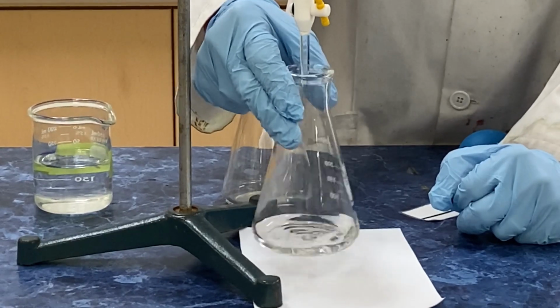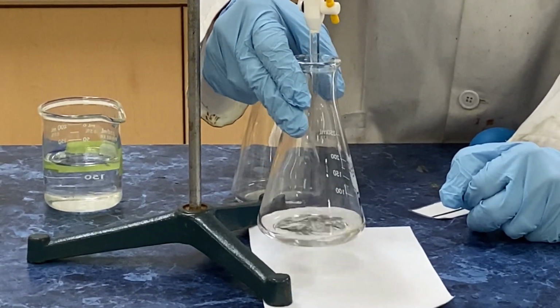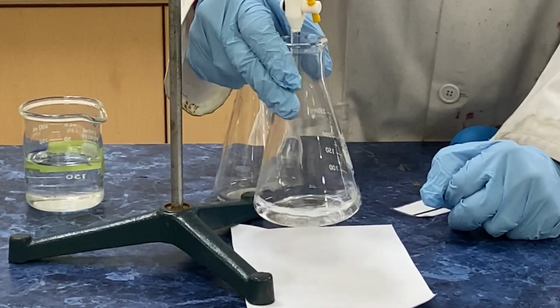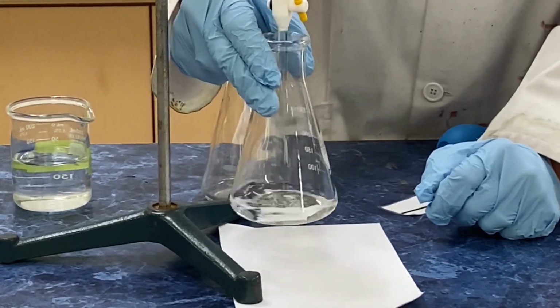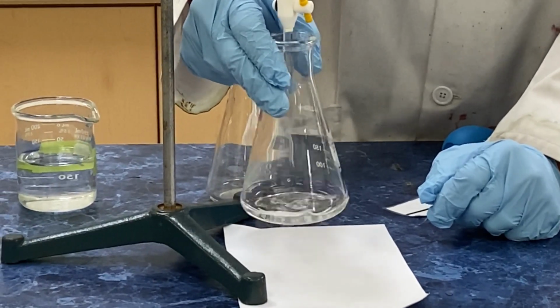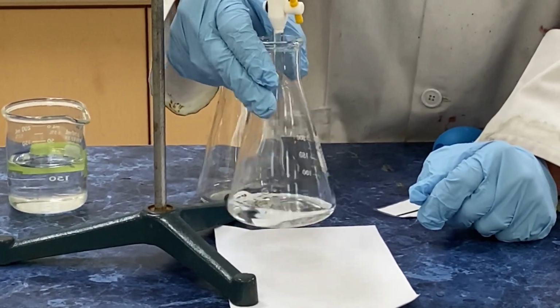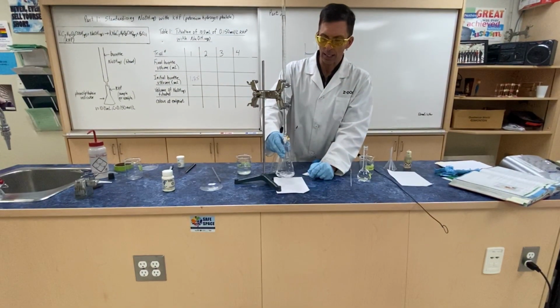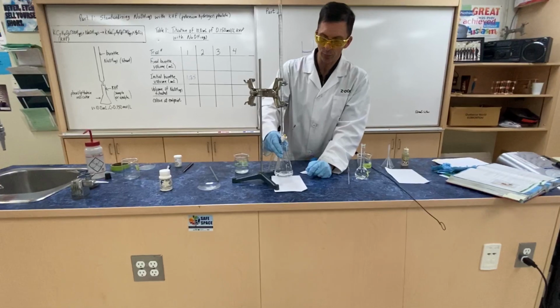Now you have kind of an idea where this is going to end. That's right, and often in our first trial, we want to get that rough idea as to where the endpoint to the reaction is, and we'll sometimes overshoot that endpoint. Our goal is to get a light pink color here at endpoint.